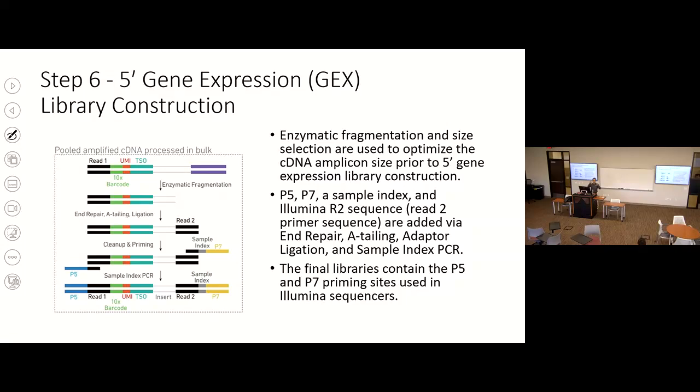For each T cell and B cell, on this side you will have their receptor isotype, basically. You have those sequences, and you know which combinations of those VDJ segments are there.